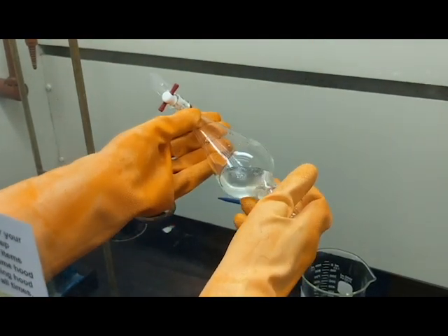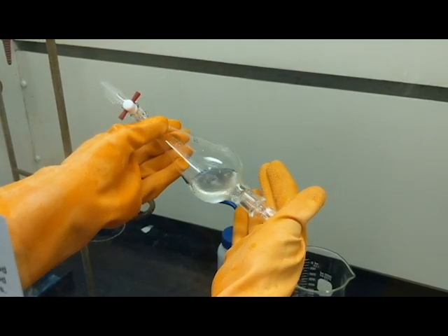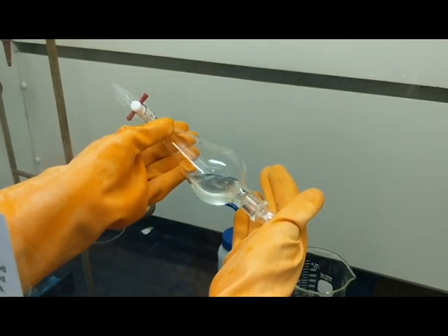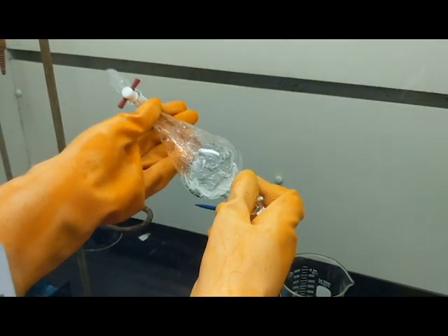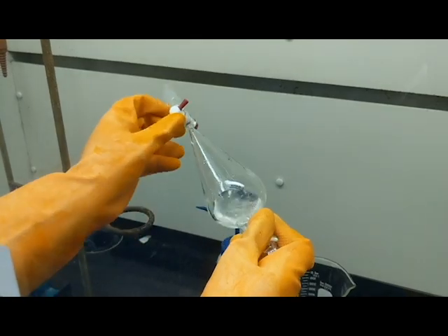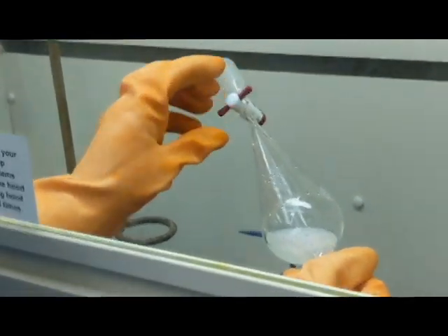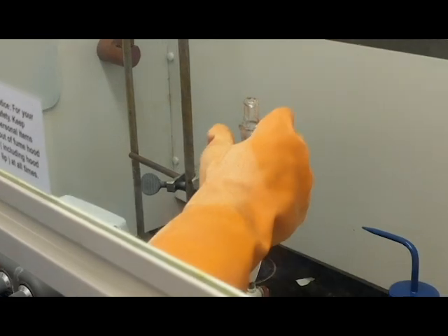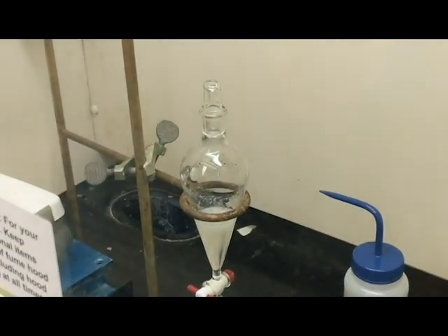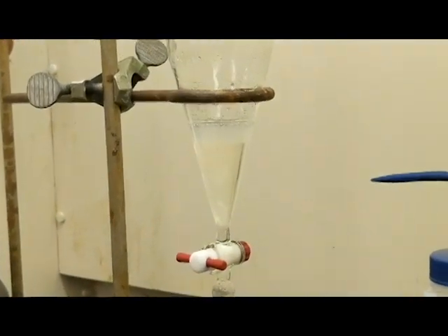Notice that I'm holding the flask with both hands and that my index finger is firmly holding the stopcock inside to make sure that it does not fall out during the venting process. Okay, so now that my 5 minutes have elapsed, the next part of this procedure is to put this back on the ring stand and allow the contents to settle so that you see a distinctive phase boundary, clearly separating the aqueous layer from the organic layer.